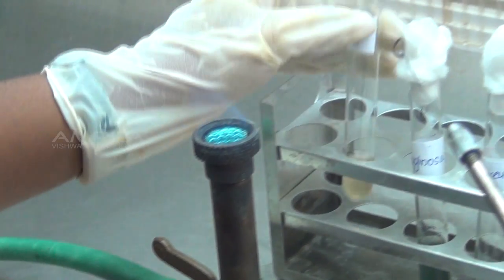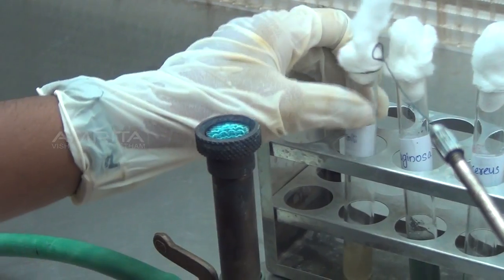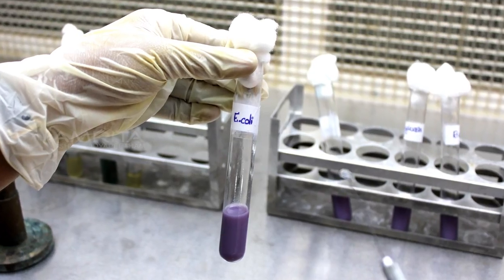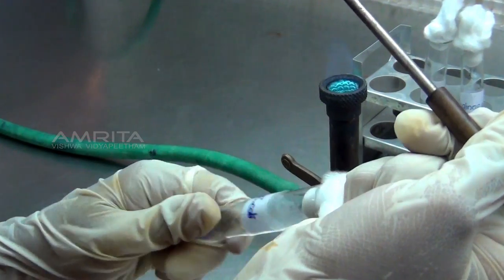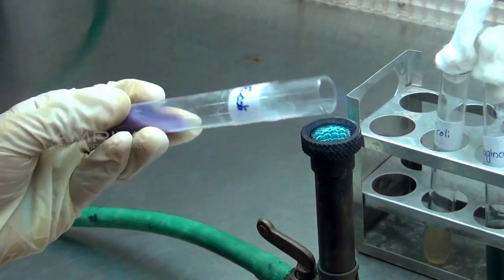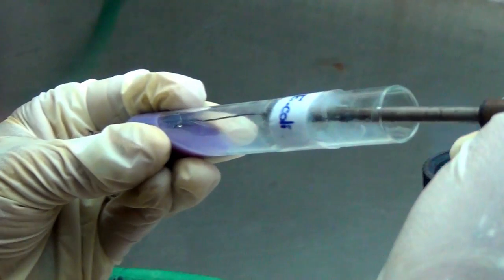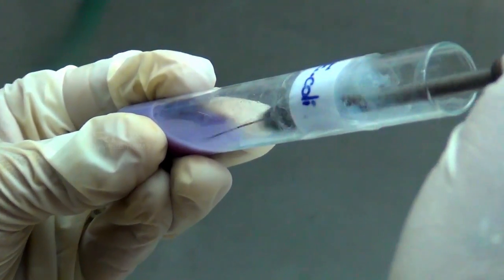Replace the cotton and return it to the rack. Take a sterile Litmus milk broth from the rack. Remove the cotton and flame the mouth of the tube. Inoculate a loop full of culture in the broth.